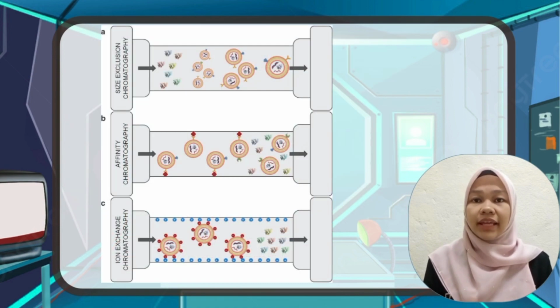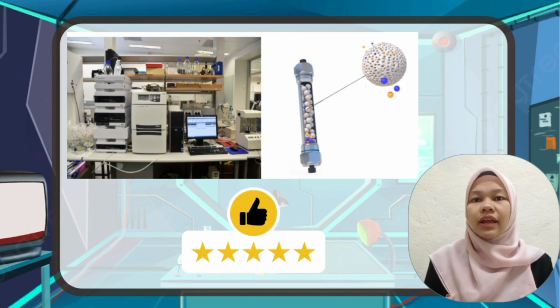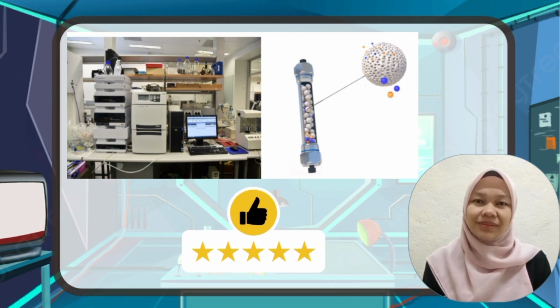Unlike techniques such as ion exchange chromatography or affinity chromatography, molecules do not bind to the chromatography resin, which means that the mobile phase composition does not directly affect resolution, the degree of separation between peaks. The gel consists of spherical beads containing pores of a specific size distribution dependent on the nature of the particles making up the gel. Therefore, SEC has an advantage in that the conditions can be varied to suit the type of sample or the requirements for further purification, analysis, or storage without altering the separation.